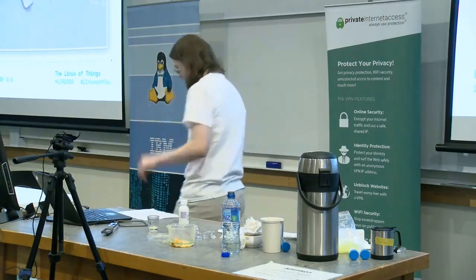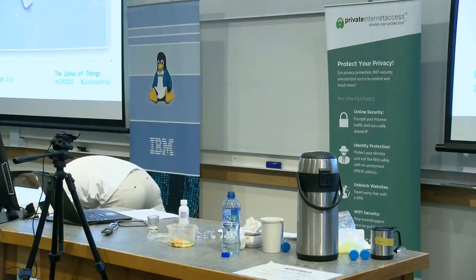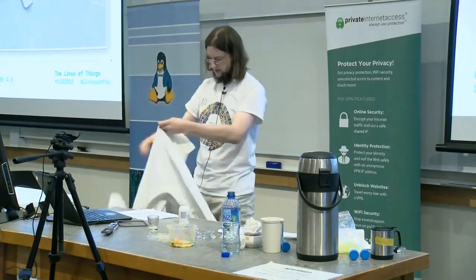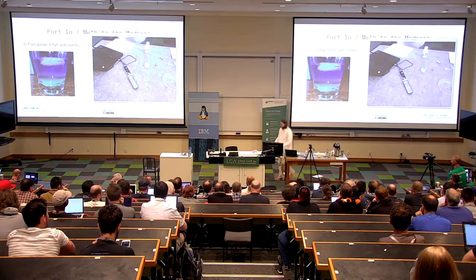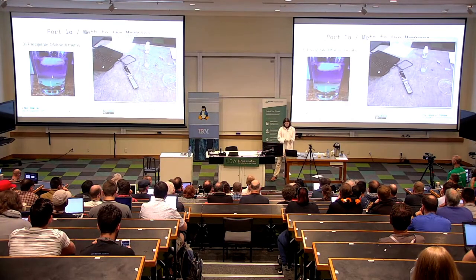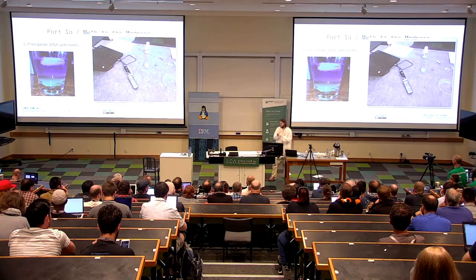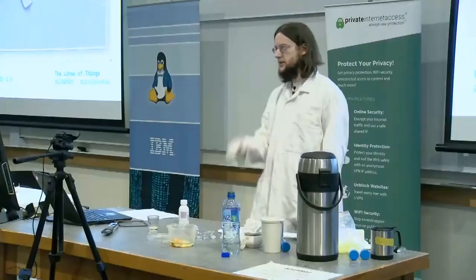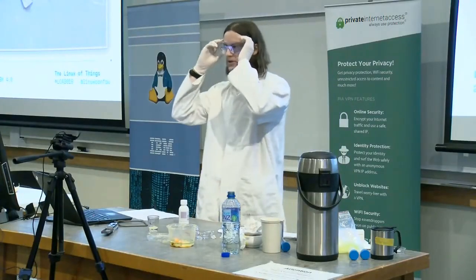Now, because this involves alcohol, I'm going to get a bit kitted up. So, got here a lab coat. I've also got some gloves. These were also bought from the pharmacy, just in case anyone wants to buy some of those, if they want to do some extraction themselves. And I do have glasses on, but I decided just to be safe, I'd have another pair.